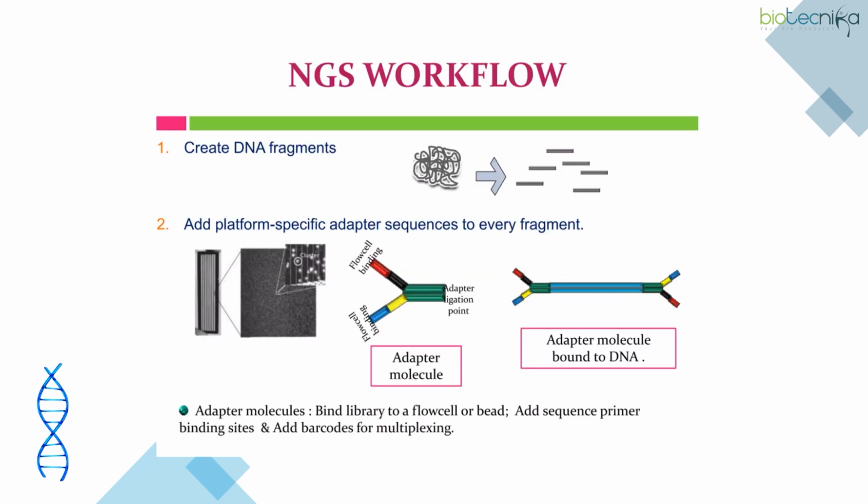So if you walk through the particular next generation workflow, you can see that it creates DNA fragments. Okay, so this is a DNA, got it? And after that, it will create the fragments. Okay, so these are the fragments of DNA. And once the fragments of DNA are made, it will add the platform specific adapter sequence to every fragment.